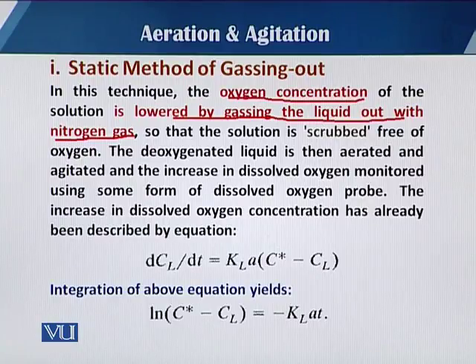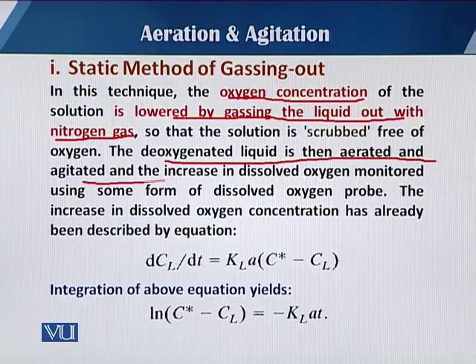The deoxygenated liquid is then aerated with proper agitation, and the increase in dissolved oxygen concentration is monitored using a probe, which we call a dissolved oxygen probe.